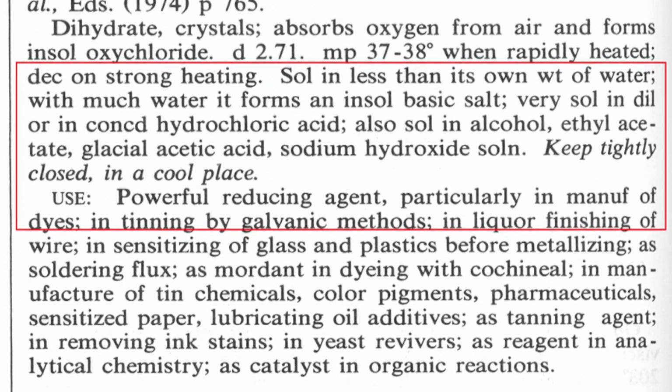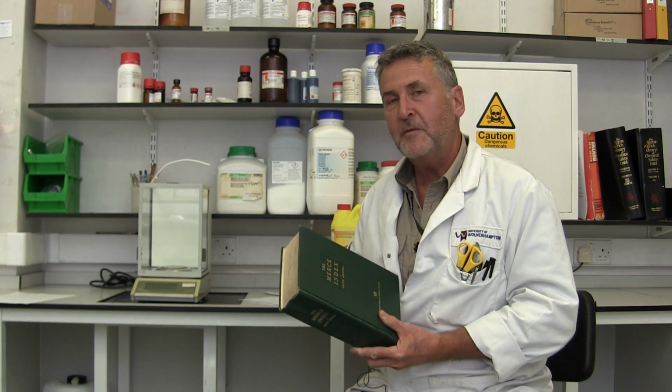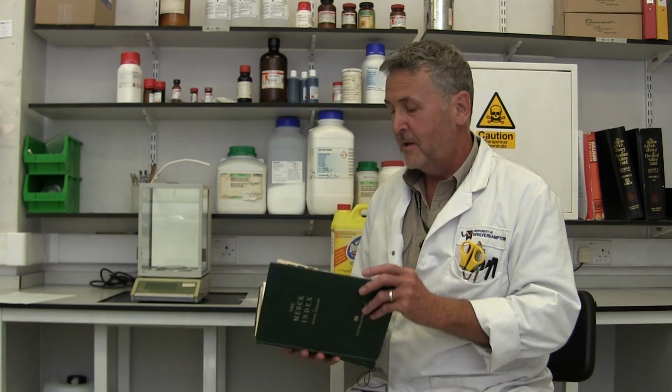If between the data sheets and this book you're not actually sure after that, you can then ask someone else, a technician, who will probably put you in the right direction. But it's wise to go through this book first, because you'll then get used to what it's like and what the information that's inside is like. It's a useful thing to know.